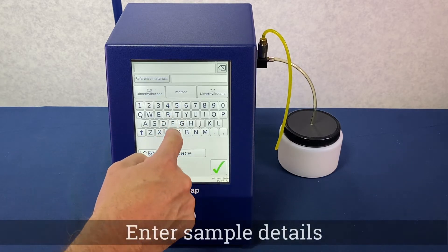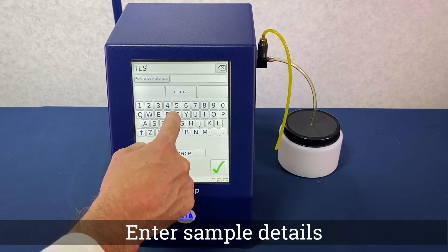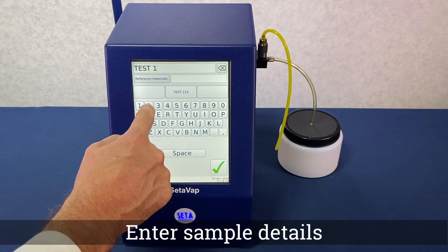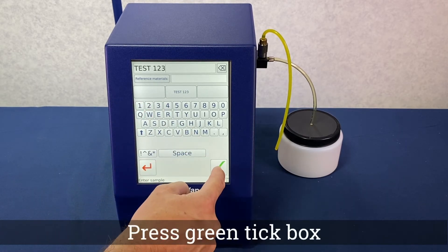Repeat with the sample ID field. Press the green tick to proceed.